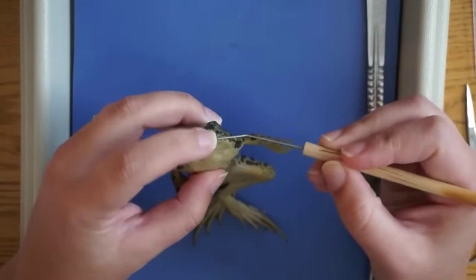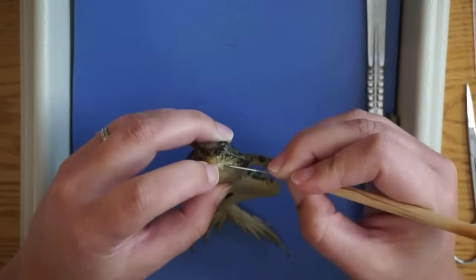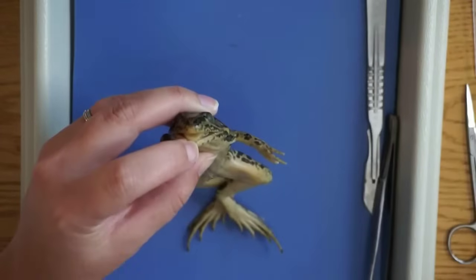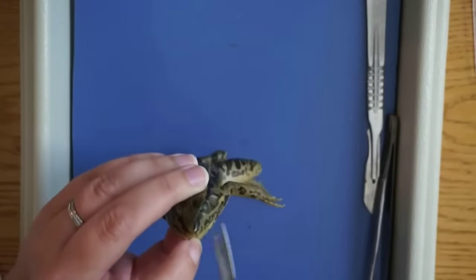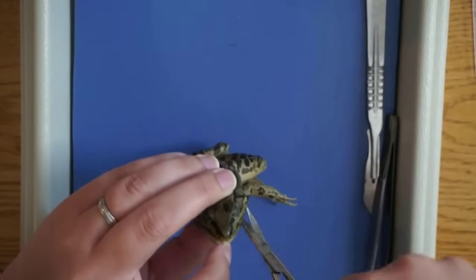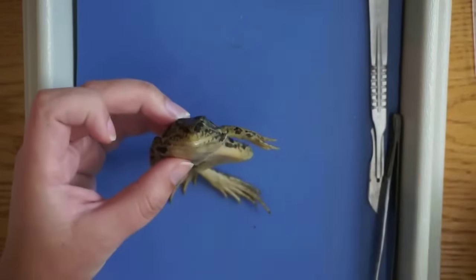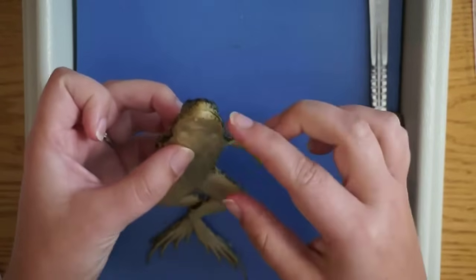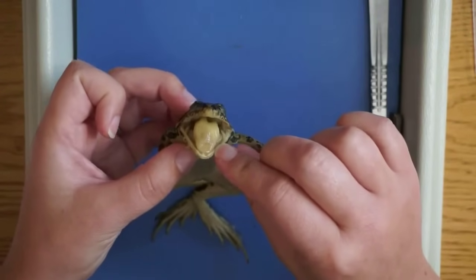We're going to look at some structures inside the frog's mouth. Try to pry the jaw open a little bit — it's probably pretty stiff. We're also going to make a little cut on either side of the jaw, cutting back just a little bit so that we can cut through the jawbone and open the frog's mouth a little bit wider. Just a little bit on both sides, then open up the mouth.